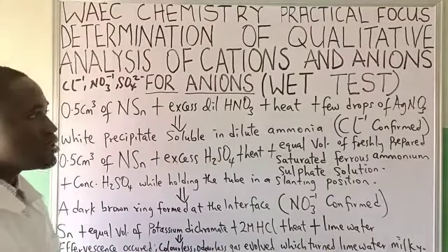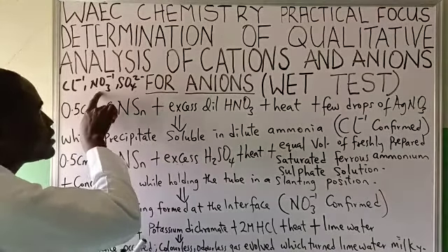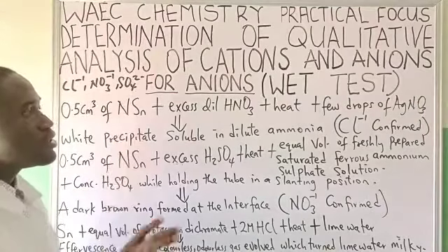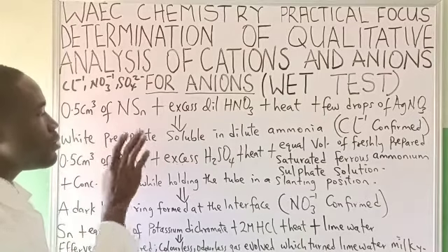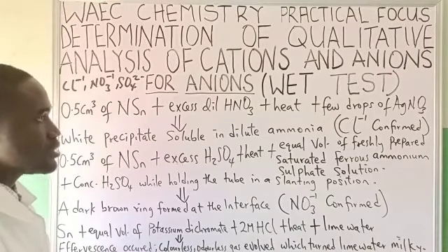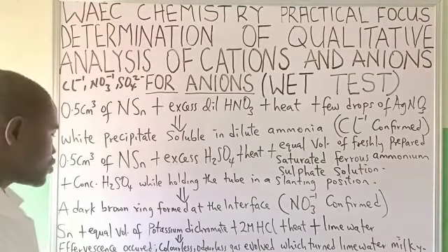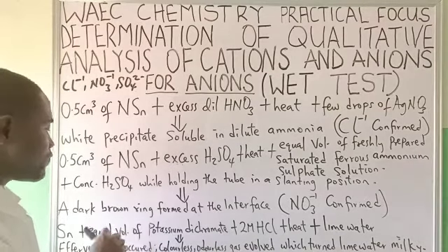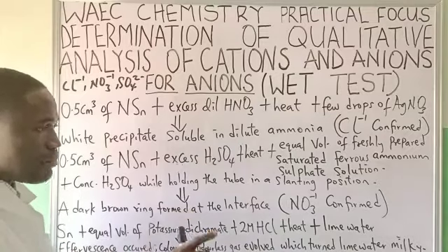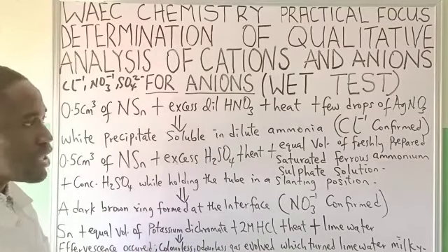We said for chloride, nitrate, and sulfate that we need the prepared sodium carbonate extract, the filtrate, to do the confirmation. We talked about that. Now, we also said we don't need the sodium carbonate extract for carbonate ion, because it's already a carbonate.